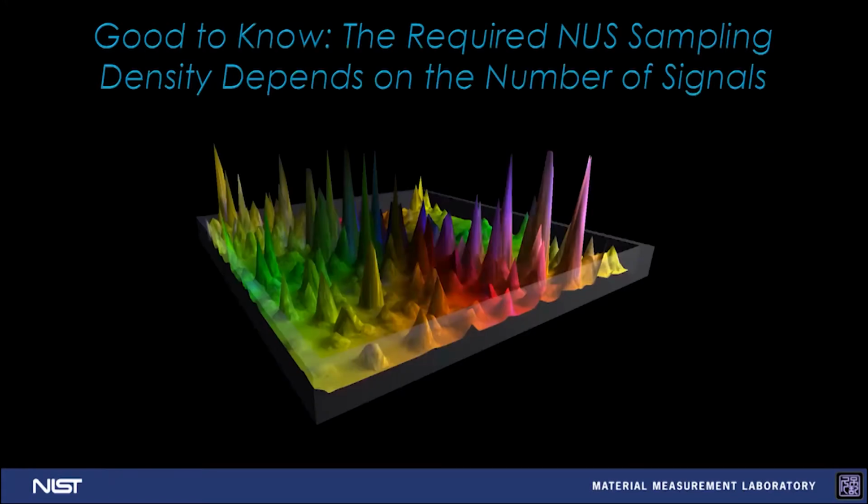So here are a couple of things that I think are interesting to know about that we don't hear spoken about enough. And one thing is that when we talk about non-uniform sampling in a casual way, we usually talk about non-uniform sampling in terms of sampling density. Oh, I did this NUS experiment at 50% density, 25% density, and so on. And for casual discussion, that's fine.